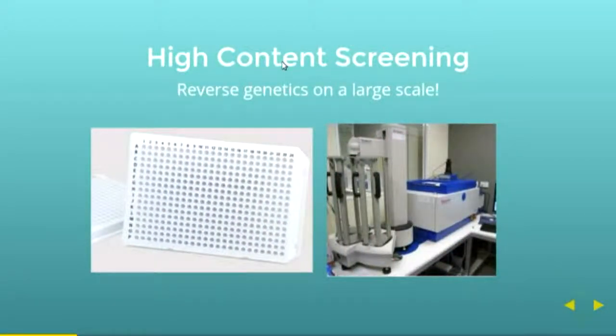One such way of doing reverse genetics on a large scale is high-content screening. High-content screening works with these 384 well plates. In each one of those wells on the plate, you put in some cell sample. Then the cell sample's gene is disturbed somehow. That could be interference RNA, which shuts off a particular gene. Then we get a whole bunch of these plates and run them through these machines. The machine there is the ThermoScientific high-content screening platform at Peter MacCallum Cancer Institute.